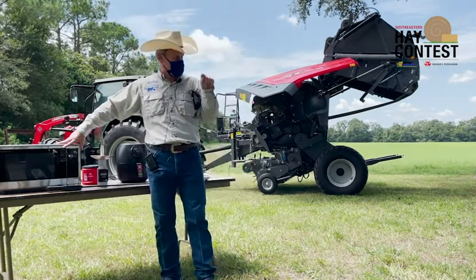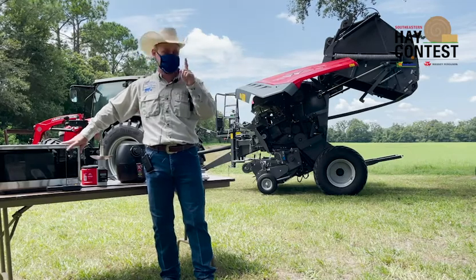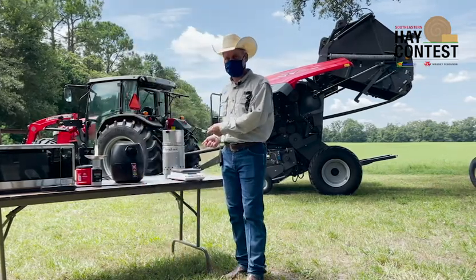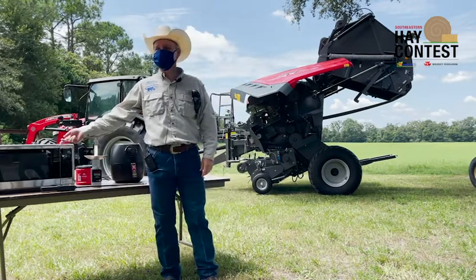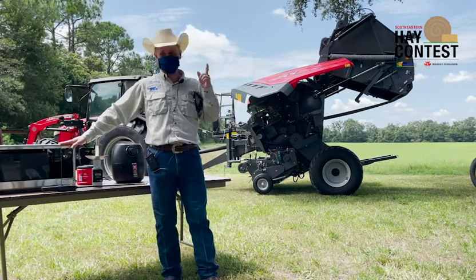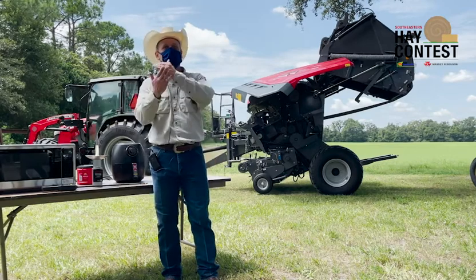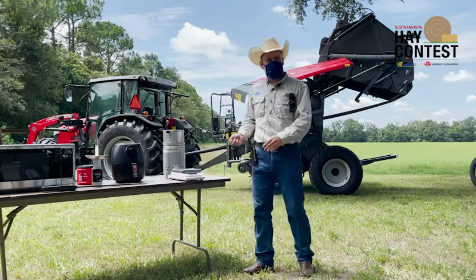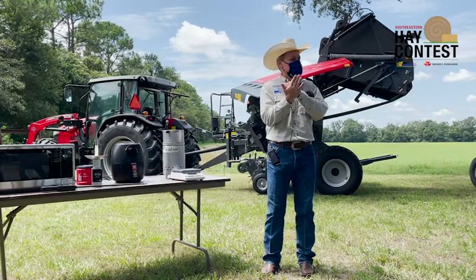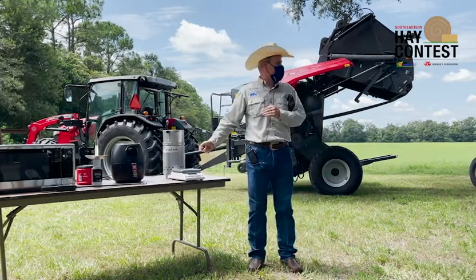Run the microwave on high for one minute. Not ten minutes — one minute. Then take it out and weigh it again, then put it back. Another one minute. After you do that five, six, seven times, you'll see the weight start repeating. That means you are not losing more water — it's dry. When you get the same weight three times in a row, that is your dry matter.